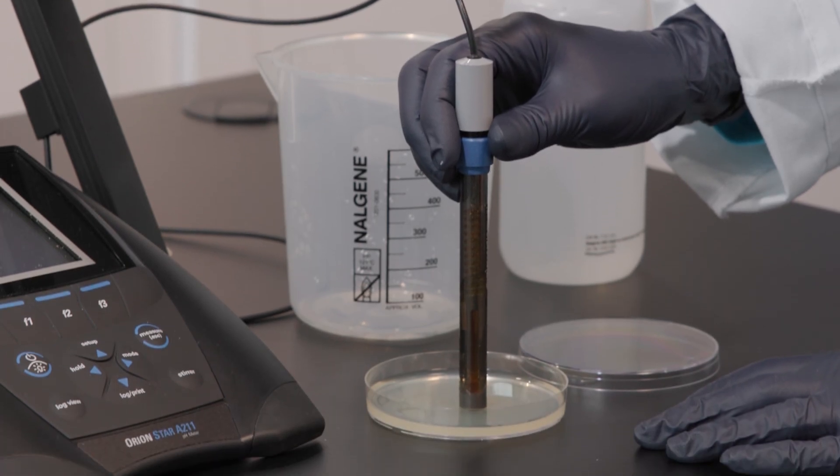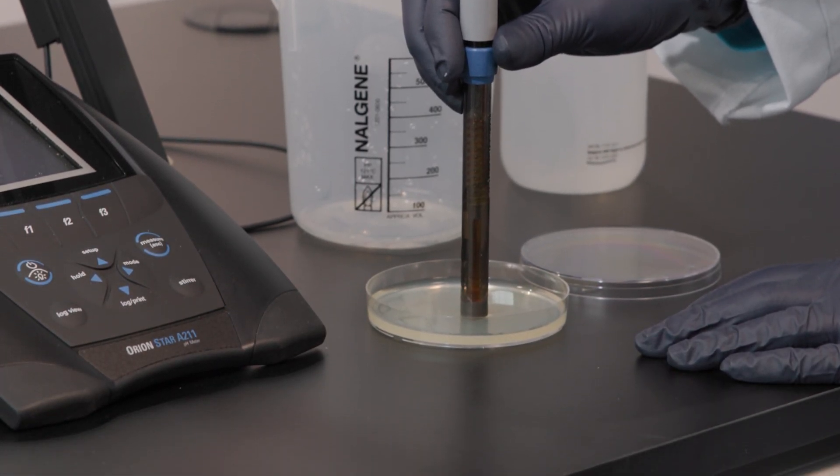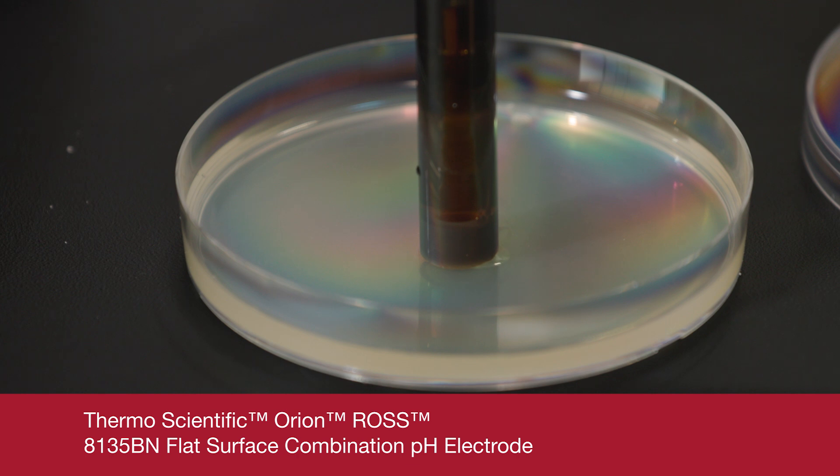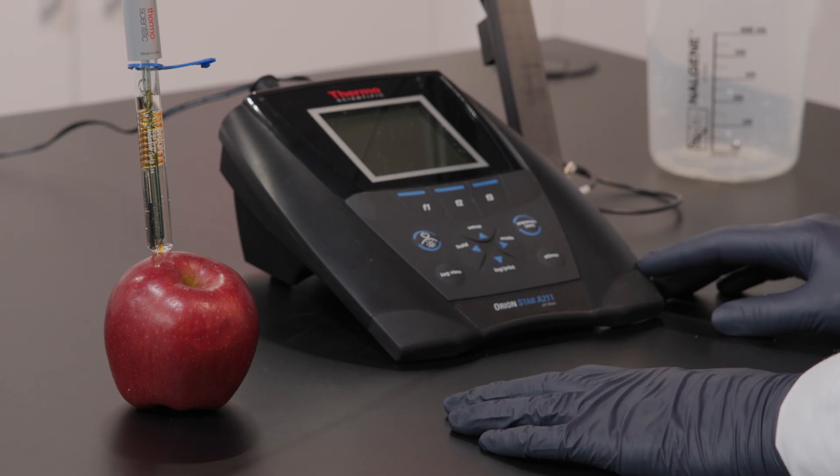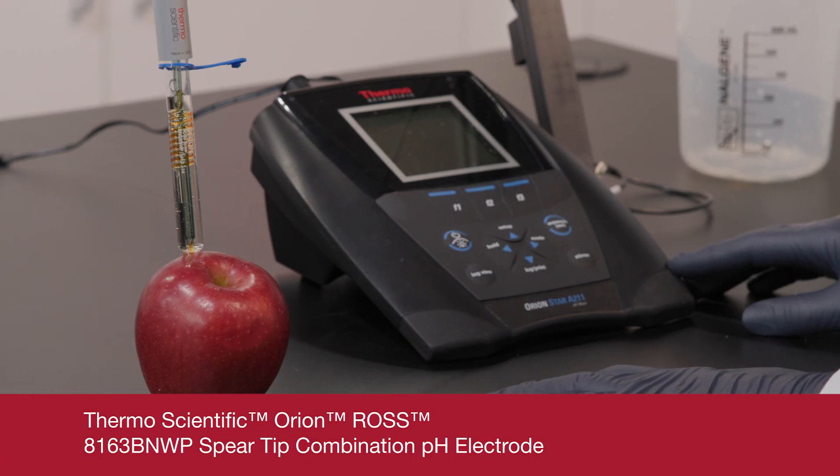For surface pH measurements conducted on paper, foods, or even agar plates, special pH electrodes with flat sensing bulbs can be used. For measurements that require some level of sample penetration, spear-tipped electrodes are available.